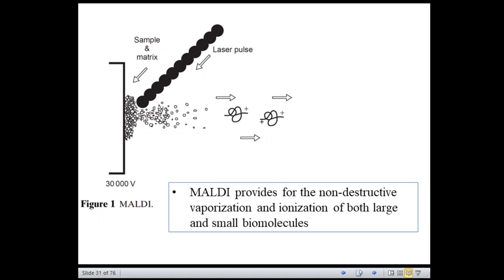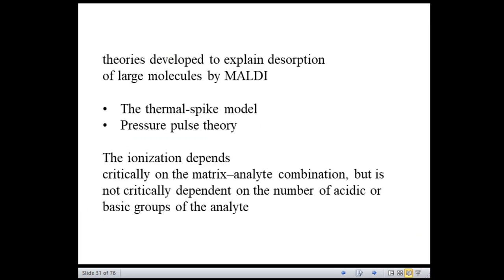As I said, the matrix plays a key role by absorbing the laser light energy and causing the analyte to vaporize.